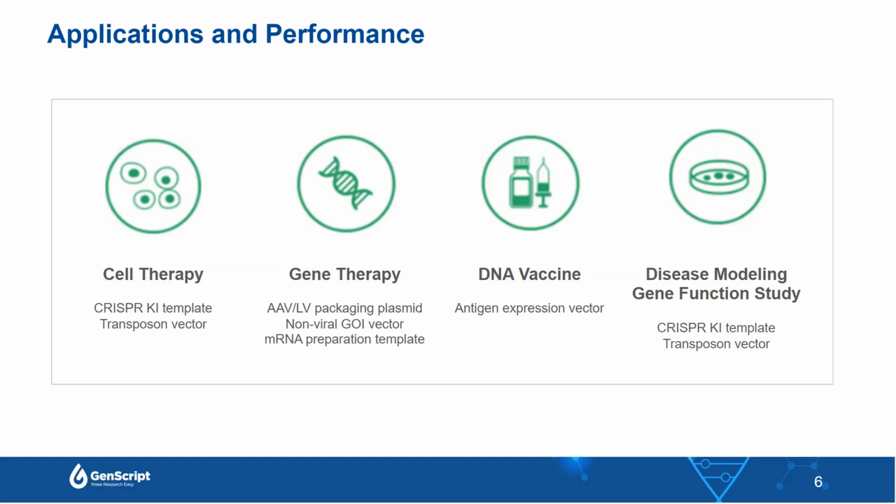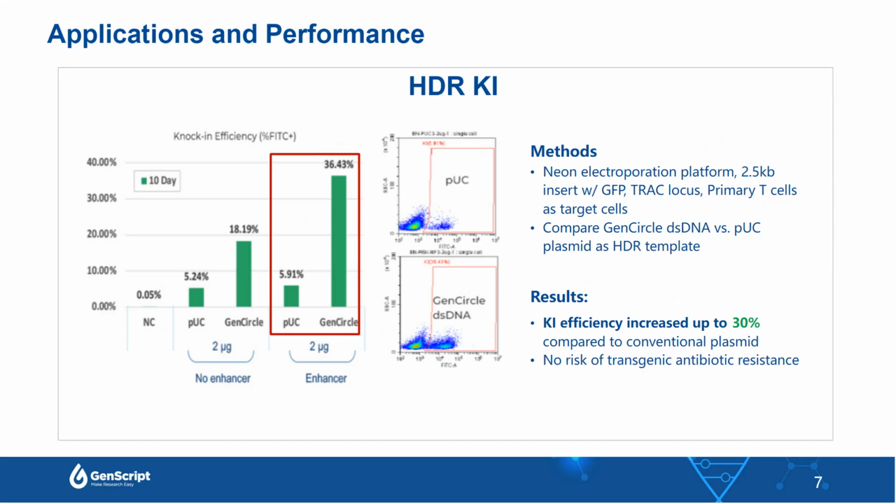It also can be used in DNA vaccine to express the antigen, and it can be used in disease modeling and gene function study. Now let me show some details of case studies. The first one is the HDR knock-in assay.